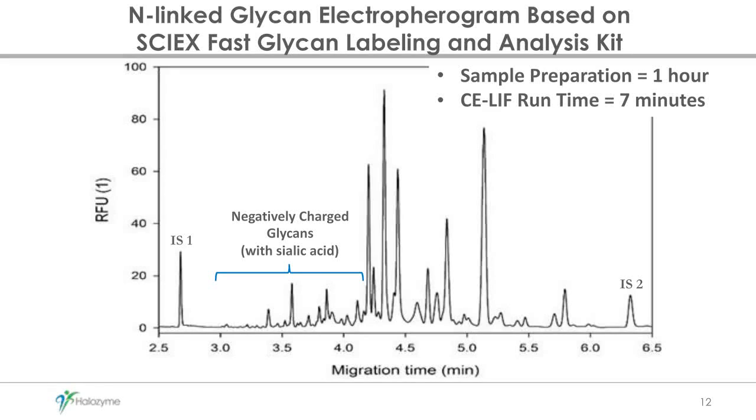So here, now I'm showing you the profile. As you can see now, we're getting even more peaks, which is great for characterization. That's kind of what we want to see. And as we optimize methods, that's what we want: to get further separation of all our glycan species.